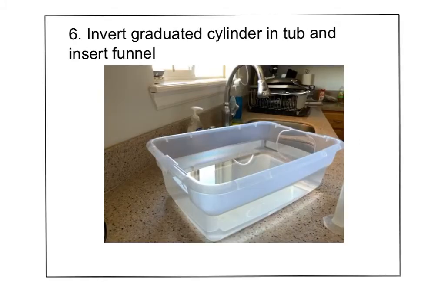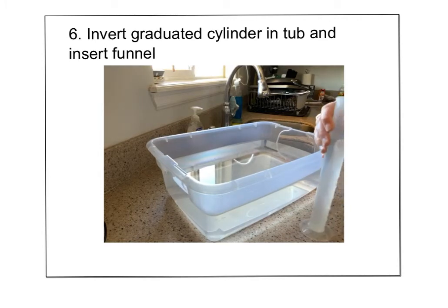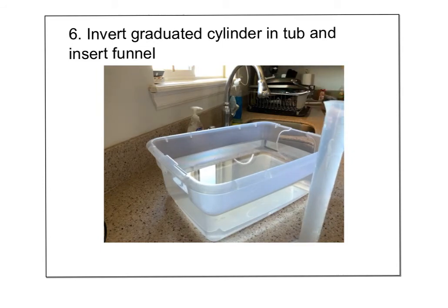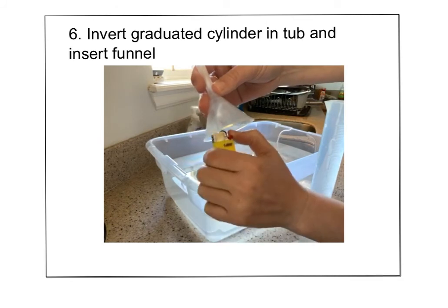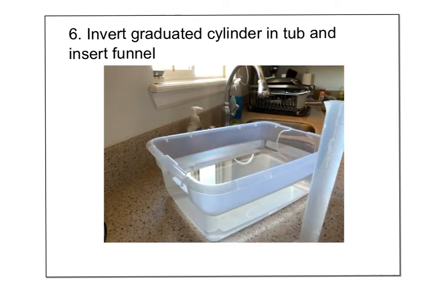Now I'll invert the graduated cylinder into the tub with no air bubbles, keeping it entirely filled with water. Unlike the video where a spray can with a long hose was used, this lighter has no hose, and I don't have a partner. So I'm going to use a funnel inside the cylinder so I don't need perfect aim when releasing the gas.